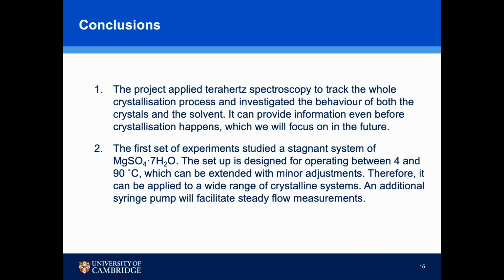So here's the conclusion for today's talk. The project applied terahertz spectroscopy to track the whole crystallization process, and it can investigate both the liquid and crystal phase, and it can also provide information before the crystallization happens, so it can show the clustering or nucleation in the terahertz spectra, which we will focus on in the future.